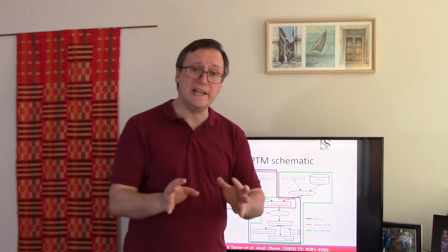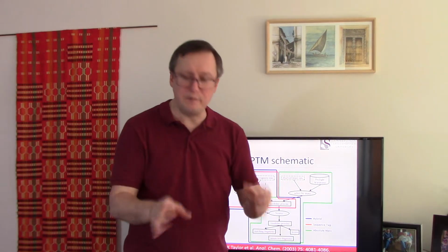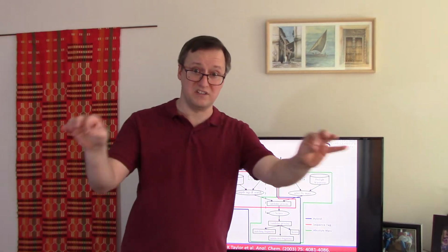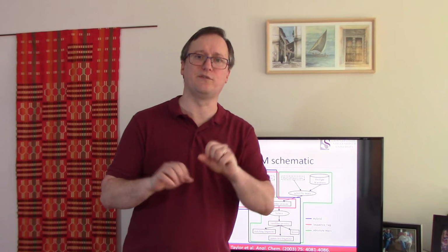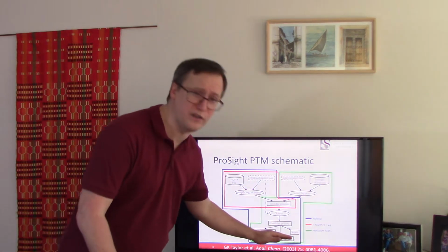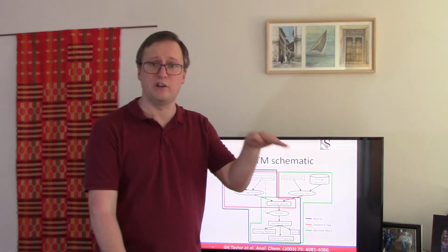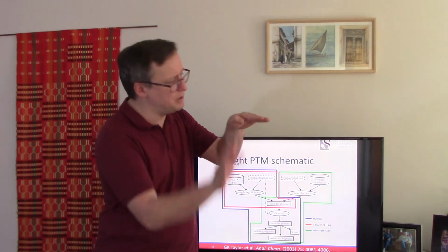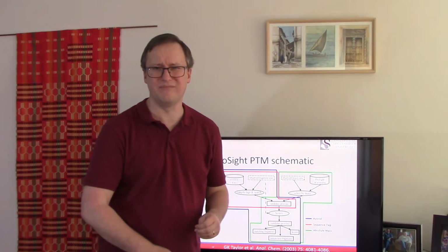For that, you're likely to go through an expansion process to say, what are all the possible decorations of this set of sequences that allow us to put 3 phosphorylations and 1 acetylation in place? And then you need to be able to score those so that you can rank the best proteoform to explain all the fragments you've seen at the top, and put the ones that are the least likely interpretations by that score at the bottom. How do you do that?